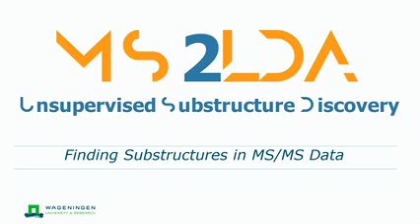Then the program of the day is that I will say a few more words about MS2LDA and its position in the landscape of metabolomics. Then we have Esteban, who will show you the power of MS2LDA in natural product discovery and how it can help to structure annotate fungal metabolites. And then we will move on with the MS2LDA version 2 tool, what it is, how we can use it, and you will also get a chance to play with it.